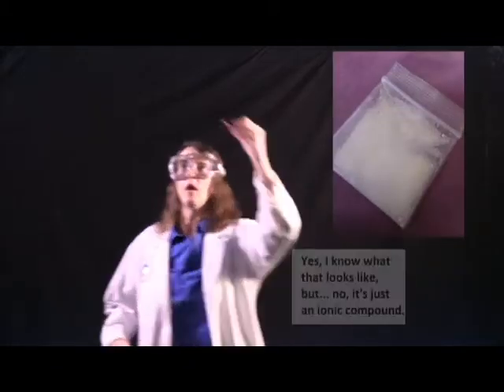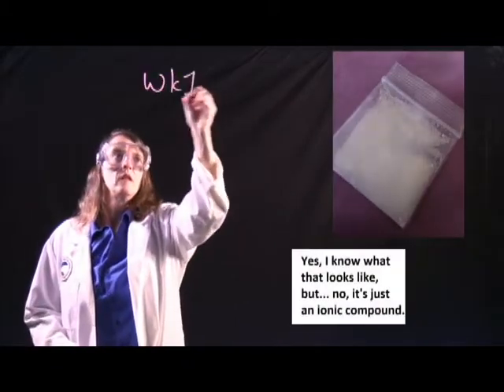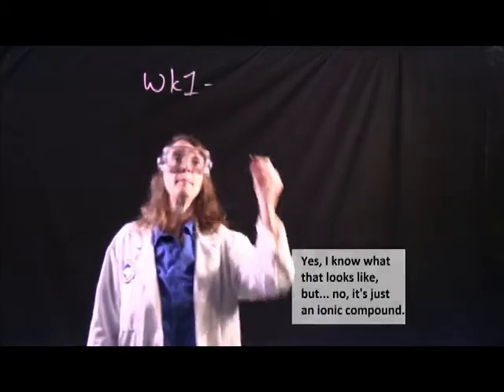Welcome to Chemistry Lab. Today's lab, the project. Actually, it's today's lab and next week's lab. It's a 2-week project. In week 1, you're going to be given a little baggie with a white powder in it, and the goal for week 1 is to identify the compound.